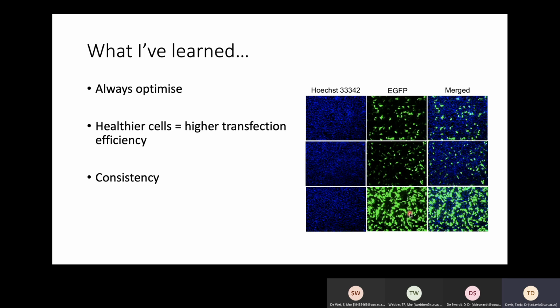So in some cases, you can have cell lines where you don't have to transfect a lot of DNA and you still get very good signal. Whereas in other cell lines, you might need a little bit more to get a good signal. But in most cases, when it comes to transfections, more doesn't necessarily mean better.